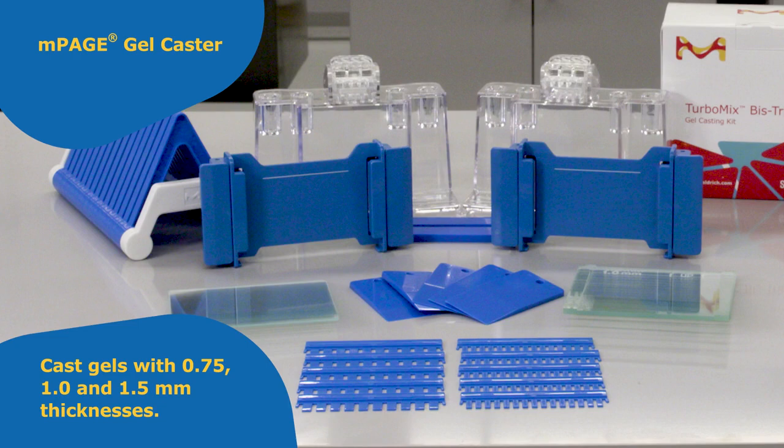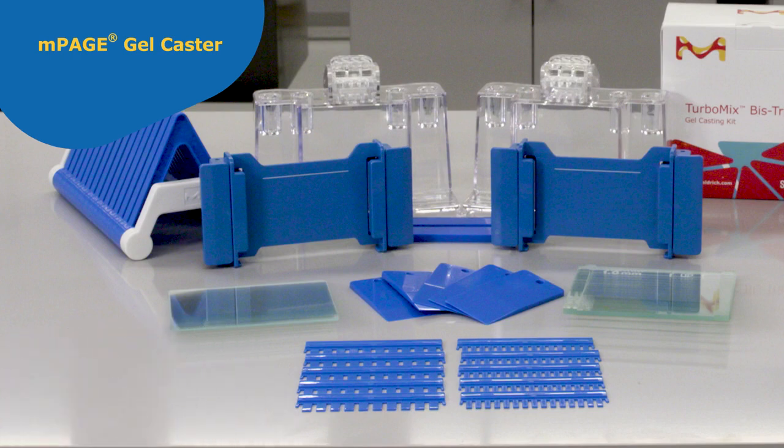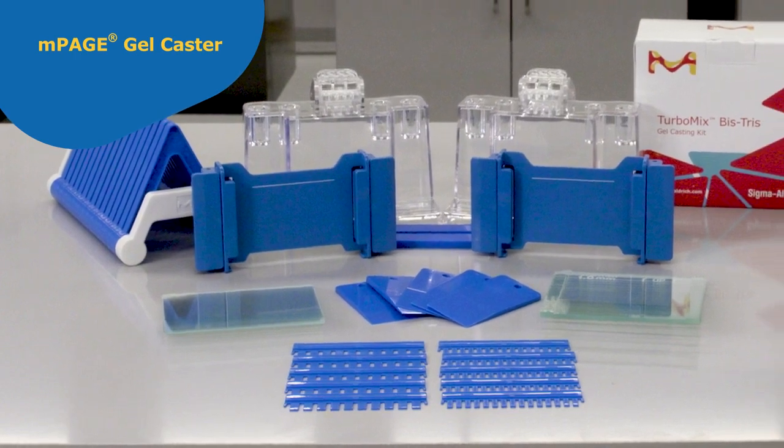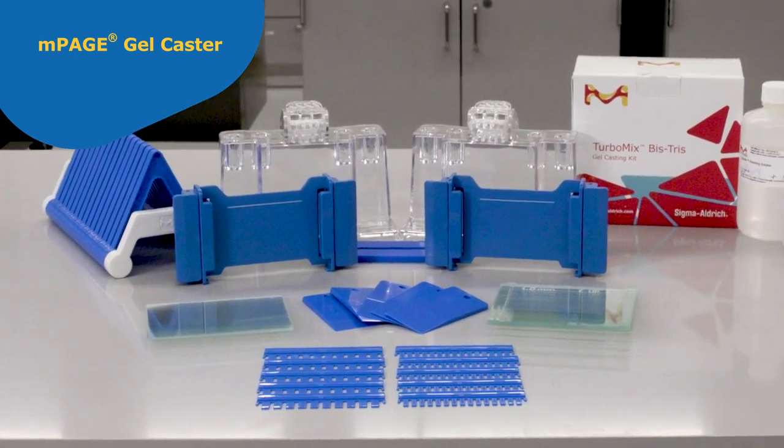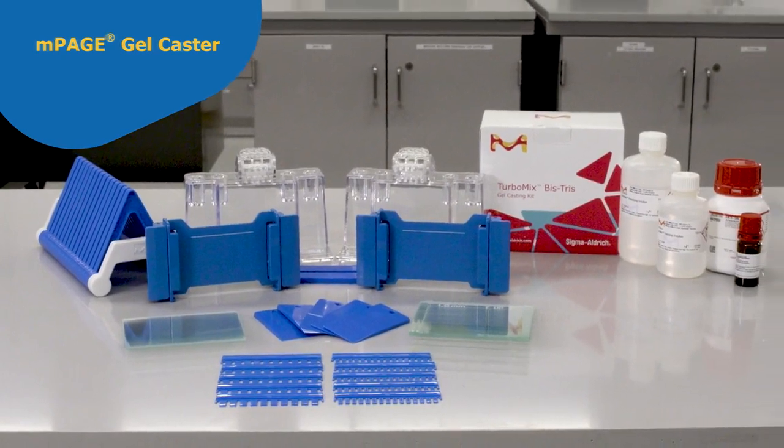The system allows for the casting of two gels at the same time. The mPage Gelcaster has been designed to simplify gel hand casting and to eliminate leakage during the casting process.